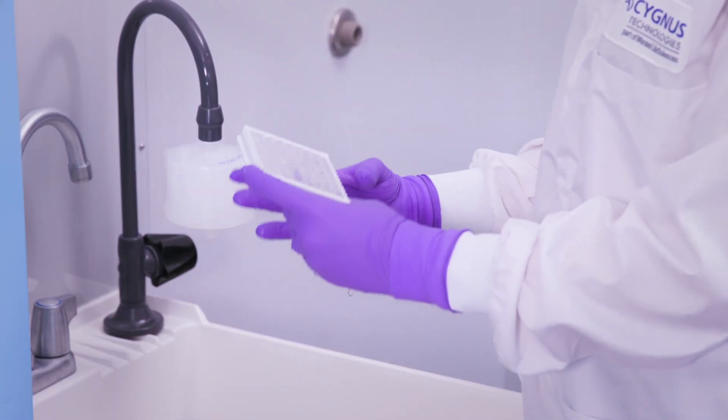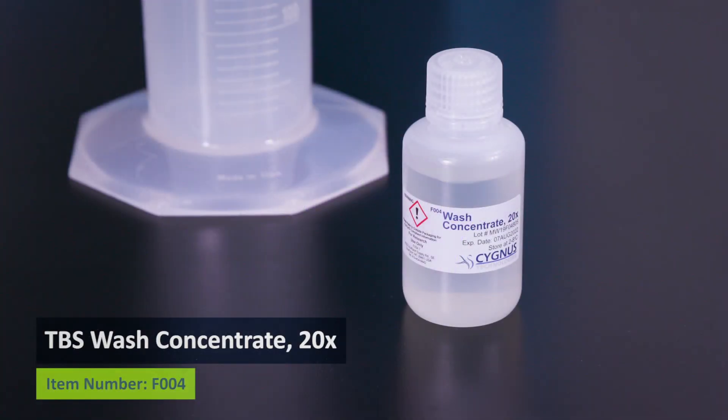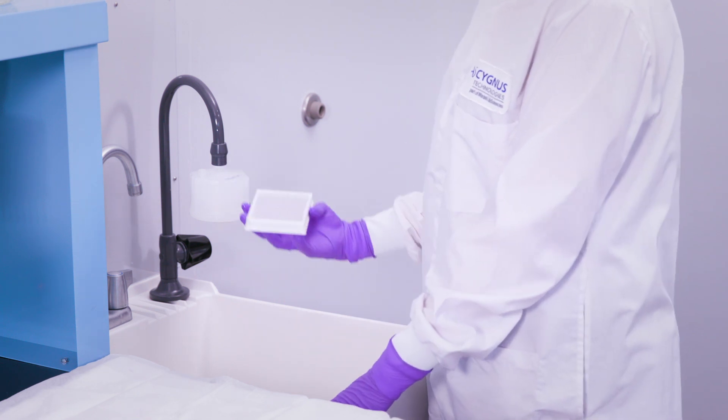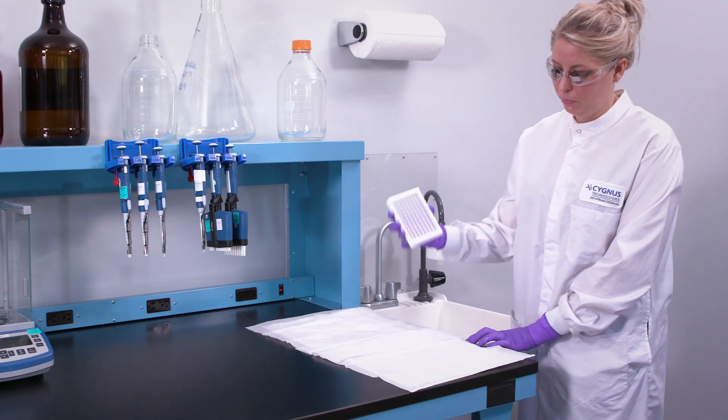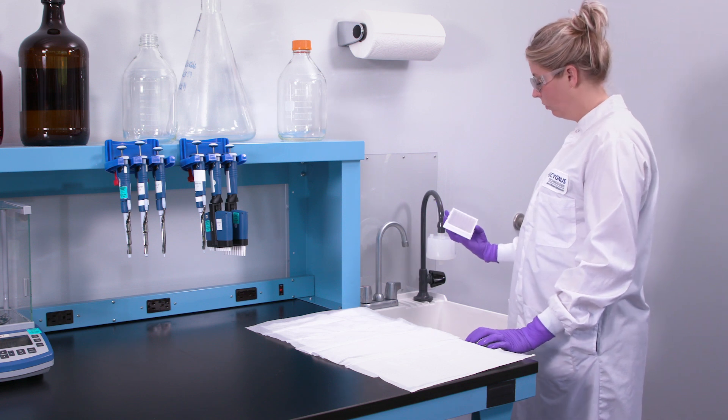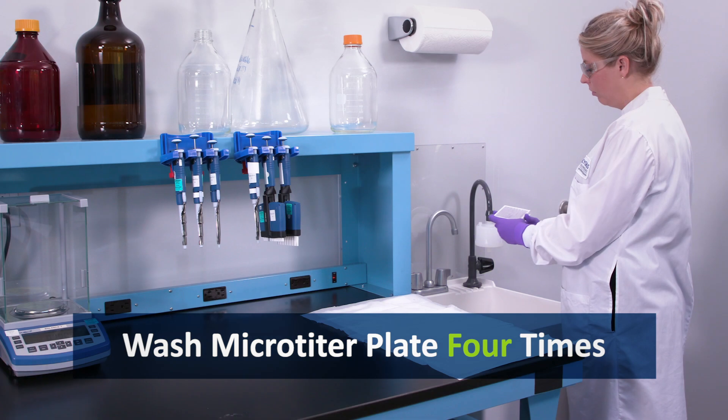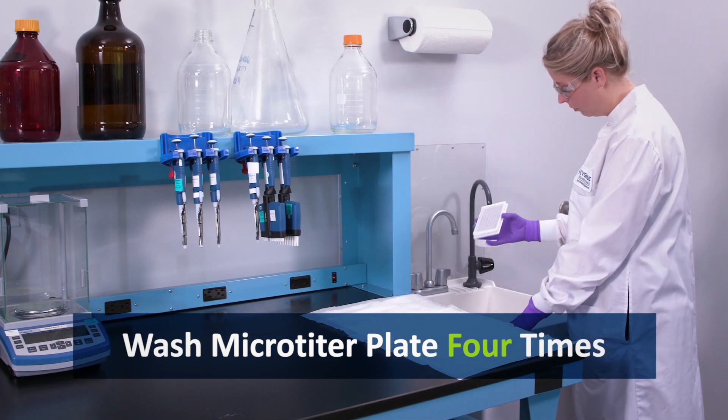Be sure that the wash solution doesn't soak in the wells, and only use the wash solution provided in your Cygnus kit. As soon as the last well is filled, immediately dump and firmly tap the plate on your blotting paper, exactly as you did earlier. Repeat this washing procedure three more times for a total of four washes.